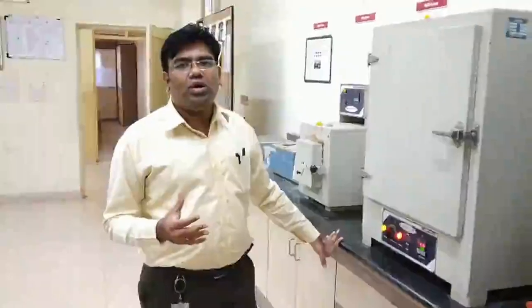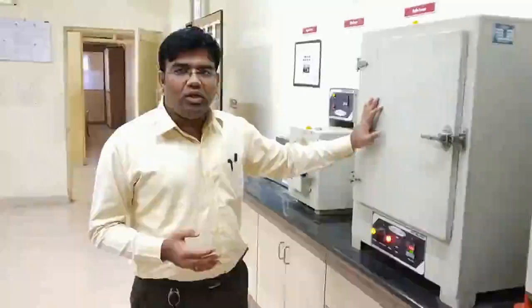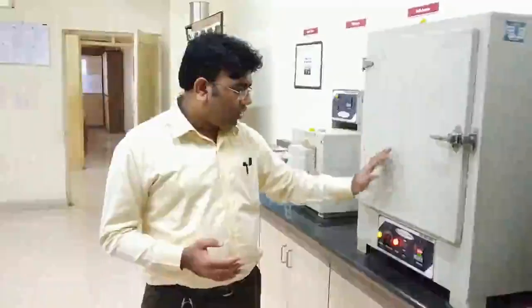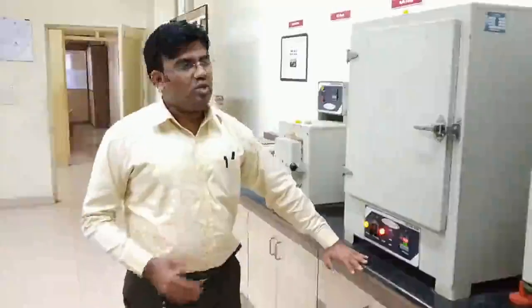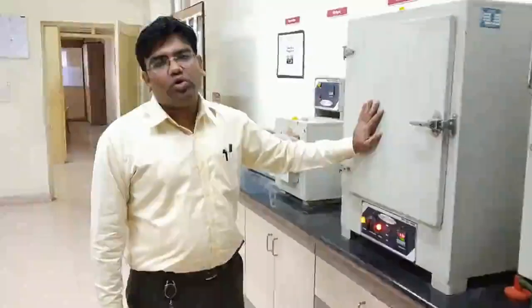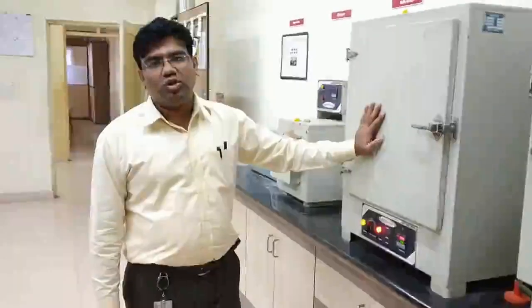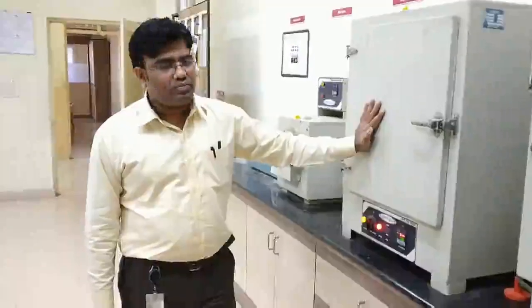So we don't want the volatile solids to get utilized. We only want the total solids and total dissolved solids, and hence we have kept this temperature in the range of 103 to 105 degrees Celsius. So we are going to keep these crucibles for 24 hours, and then we are going to measure the final weight, and then we'll be calculating the total solids and total dissolved solids.